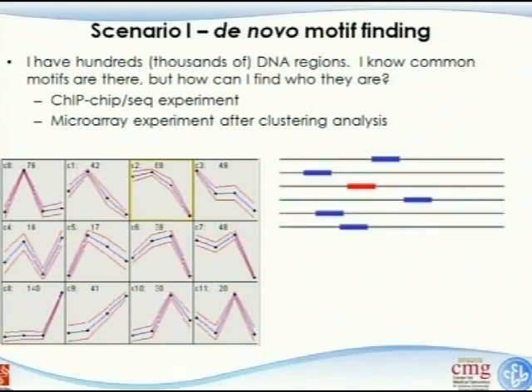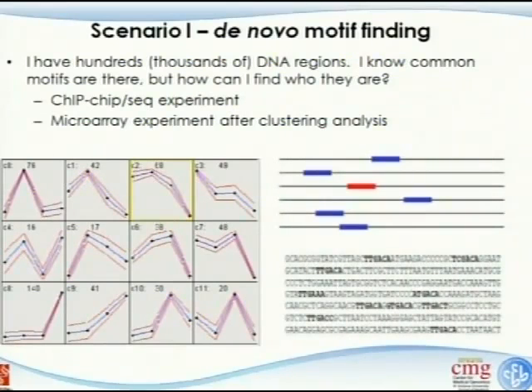It's not really an easy task if you look at the problem in this way. These are the ACGT sequences you identified from ChIP-seq, and the bold ones are the real binding sites. If they are perfect binding sites, like AACCGT, that's straightforward and a little bit easier, and people can still do it. But we know that for motif finding, there's degeneracy. For one location, if there's a one- or two-letter mismatch, it can still be a binding site. And at that stage, using something simple really doesn't help too much.